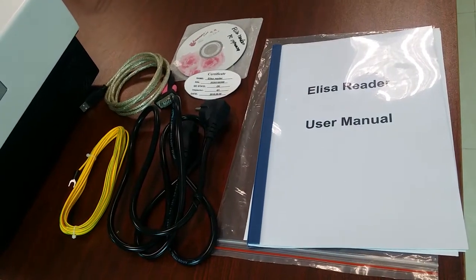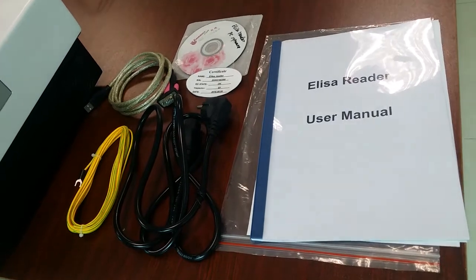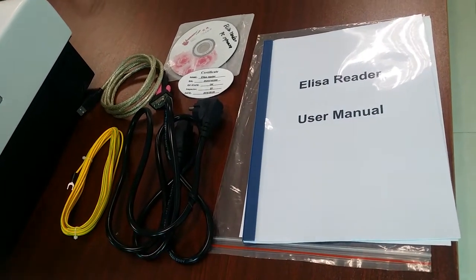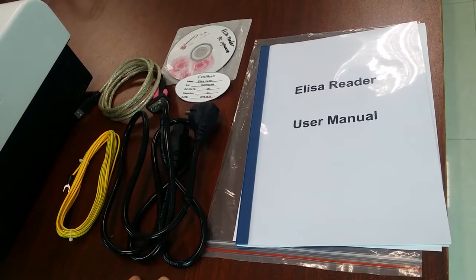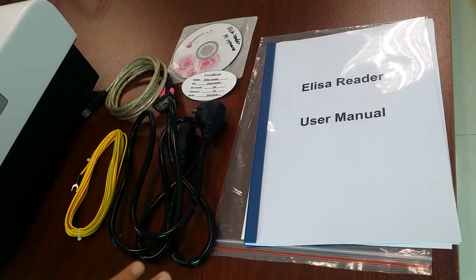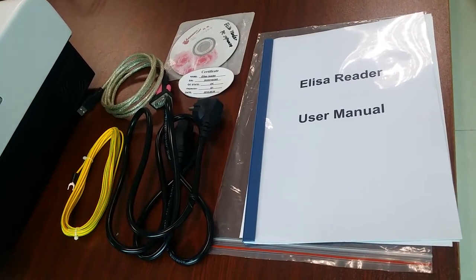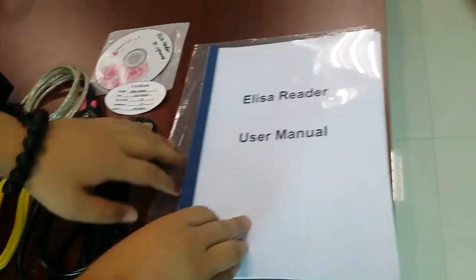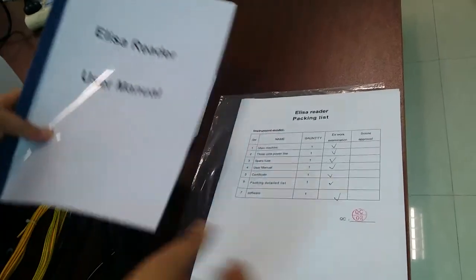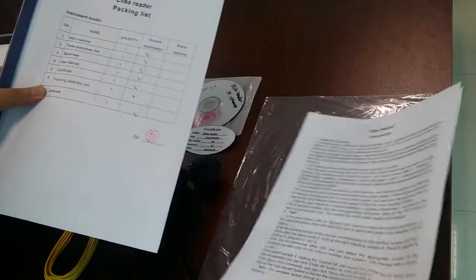Thanks for buying our Elisa Red SK202. After you get our machine, you will find three cables, some documents, and one CD software. Now let me introduce how to use this and how to install and test with our machine. You will find some documents: the Elisa Red user manual, the Elisa Red packing list, and the Elisa Red user guide.